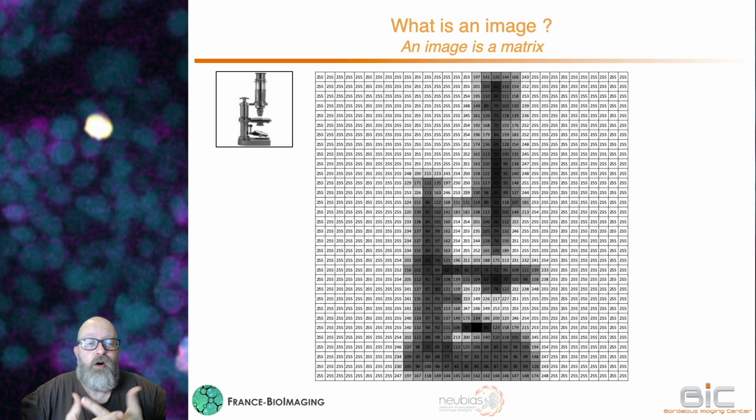But of course, there are plenty of possible values in real life. You don't see any sharp gradient of light. You see a continuous variation of the light when looking at the scene. Unfortunately, to represent this the proper way, you would need a lot of possible values.